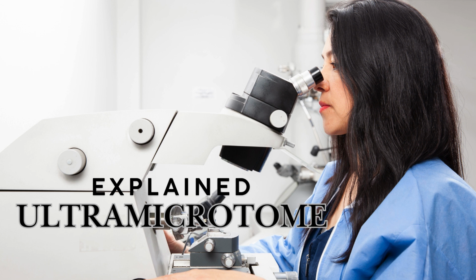Well, the word itself, ultramicrotome, is kind of a mouthful. So what can you tell us about the word itself? Well, like any good word, it's got a story to tell. So let's break it down. Micro, we know, means small. And tome refers to cutting. Like a microtome is used to make slices for a regular microscope.